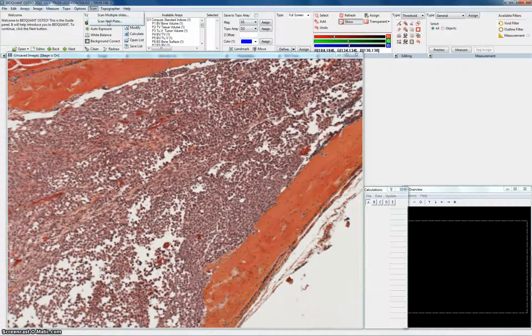You can do that by lowering the stage, and instead of putting the slides, you could put the whole plate. But please, if you did that or done anything else to the microscope, like inserted a certain field or changed it from the bright field to the dark field or something like that, please put it back to default after you finish, so whoever's going to use it after you will be able to actually use it.